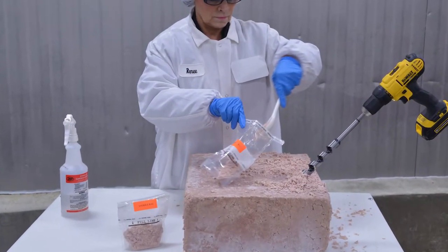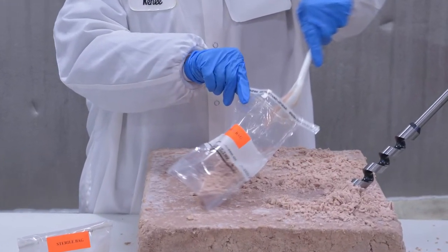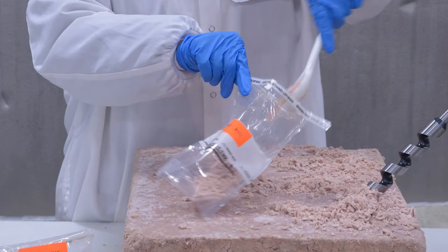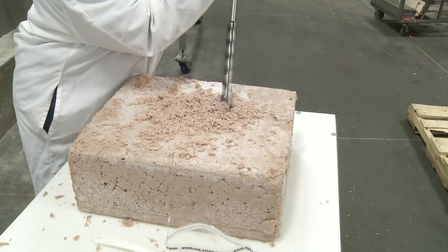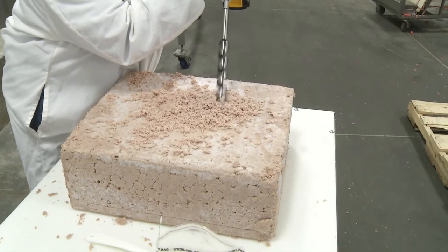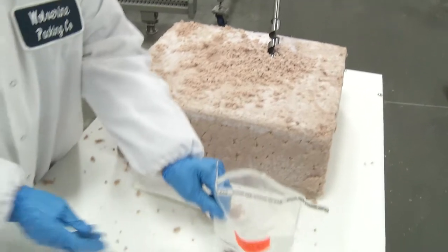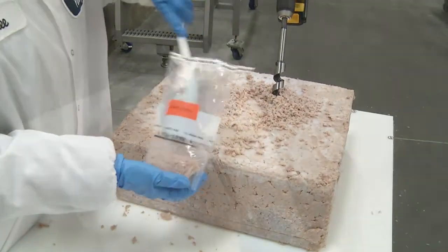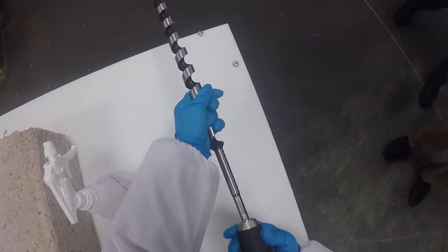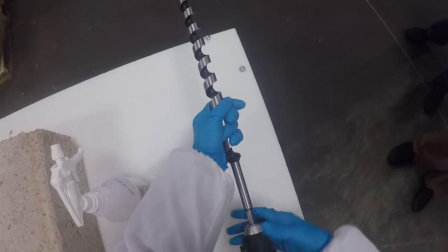It's important to remember that the equipment must be appropriate for the purpose, and in this case, the purpose is to secure shavings from frozen product. Consequently, the drill must be capable of drilling into the frozen product at an appropriate speed. The drill bit must also be able to produce large enough shavings that can be collected and placed in a sample bag. The drill should be a variable speed, heavy-duty, electric drill capable of drilling into frozen product.